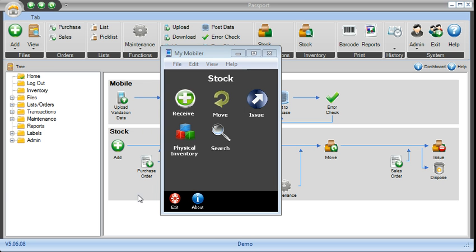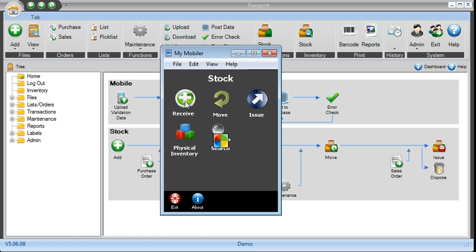And simply tap on any transactional icon to start the tracking. So to receive, with your finger, you tap on the receive icon.